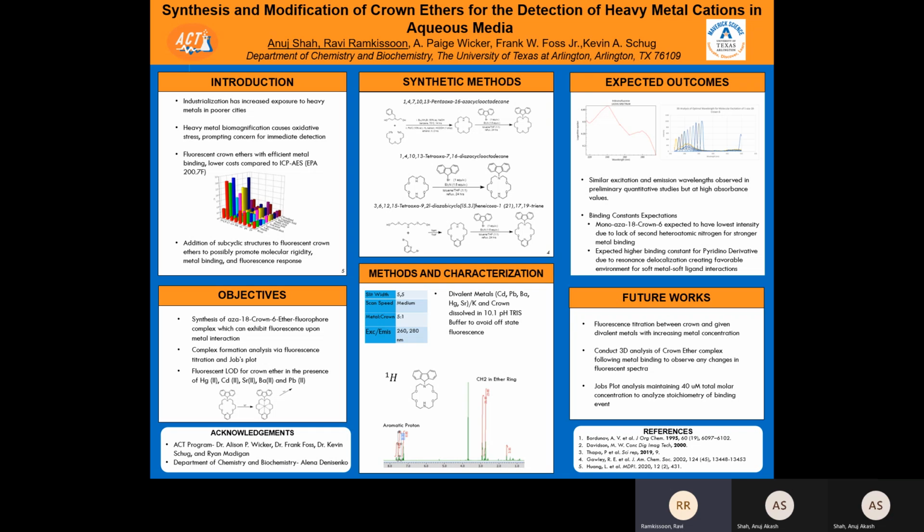And so the spectrophotometer excites the molecule every 10 nanometers and records its emissive response. So based on this, we're able to analyze which excitation wavelength produces the highest emissive response so we can get the best possible results. And so based on this, we got an optimum excitation wavelength of 260 nanometers across our crown ethers, likely due to the addition of dibromofluorene, the same fluorophore.